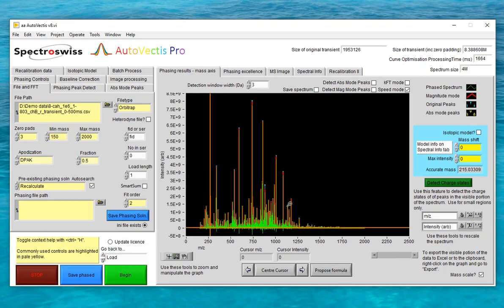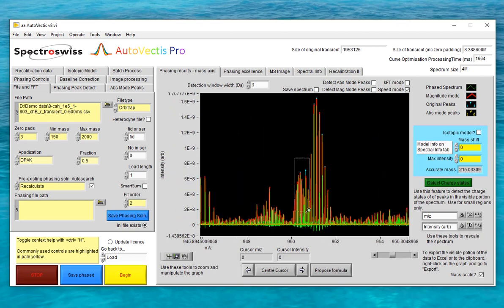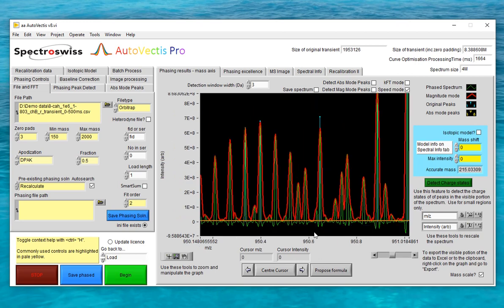So although the Recalculate route looks complicated, in practice most of that workflow is automated under the covers by Autovectus and all you'll have to do is click the odd accept button here or there. Now we've looked at the Recalculate route, let's go on to look at the even more simple ab initio route.